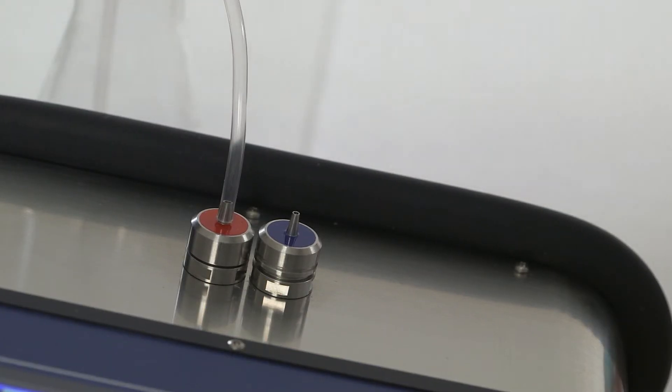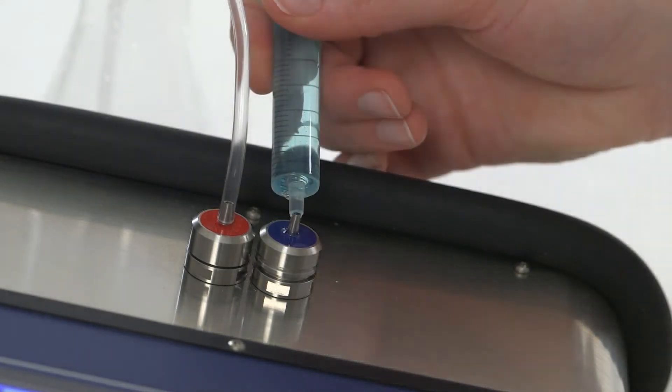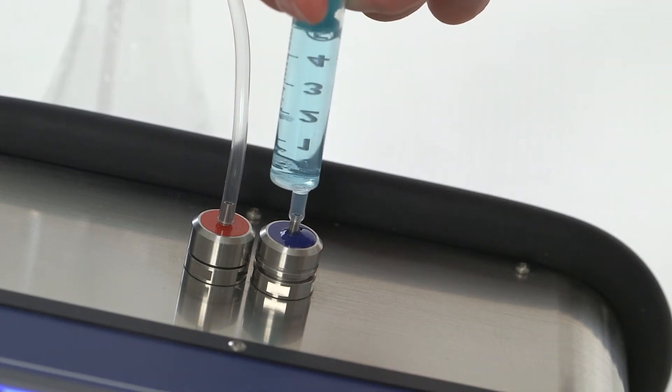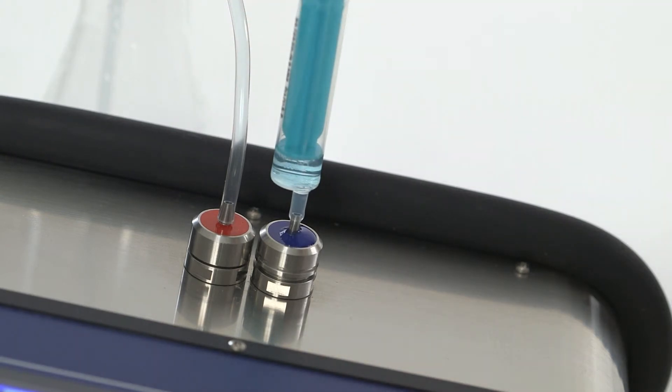Perform a zero check to zero set the instrument and validate linearity. Inject at least 5 milliliters of MERIS check, warmed to 40 degrees Celsius. Leave the syringe on the inlet and leave some of the solution in the syringe to prevent air entering the cuvette and causing false results.